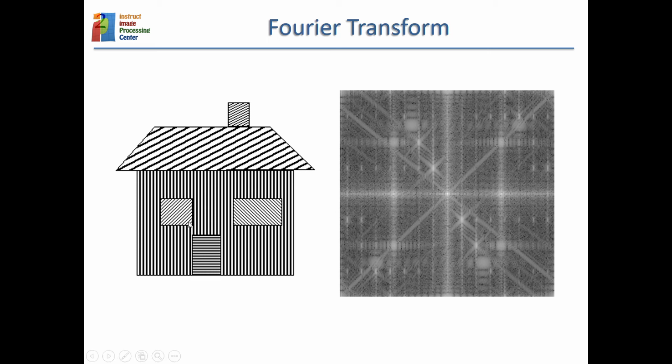And here are some examples. Let's say that we have, for instance, like in this house, the wall of the house. For the wall of the house, we need a vertical wave of a given frequency, of a given period. So we annotate that, let's say that this is the correct period. This is the frequency axis, so this is the inverse of the period.